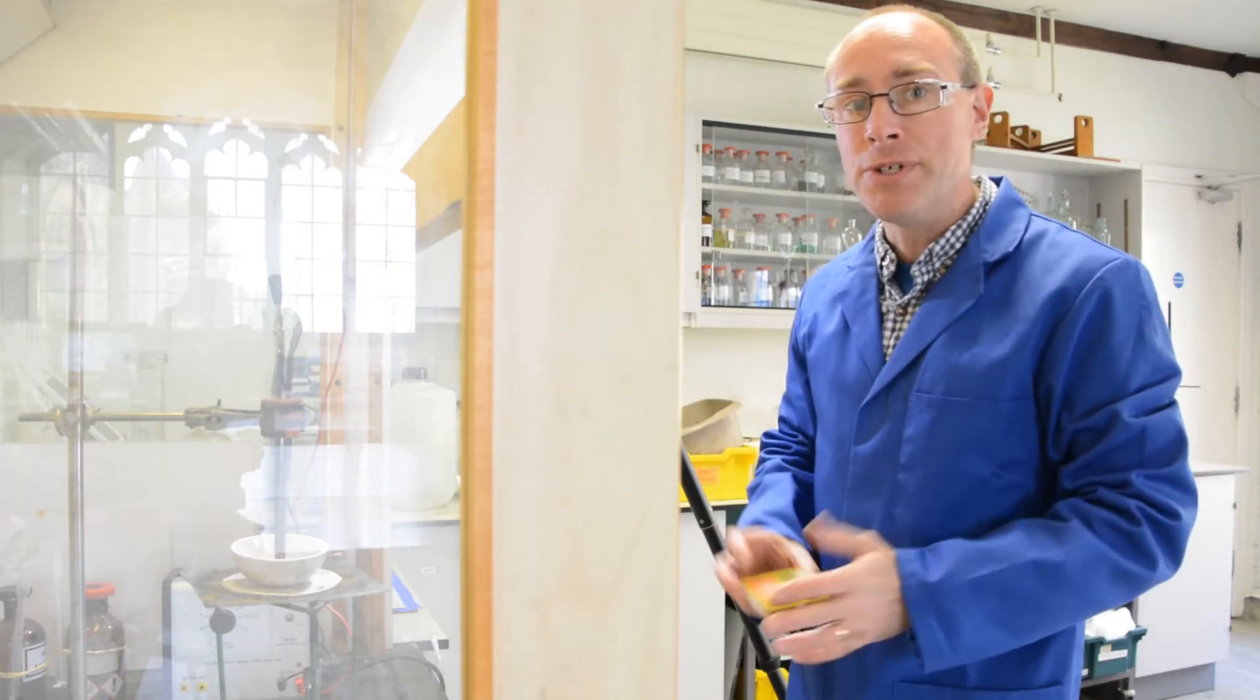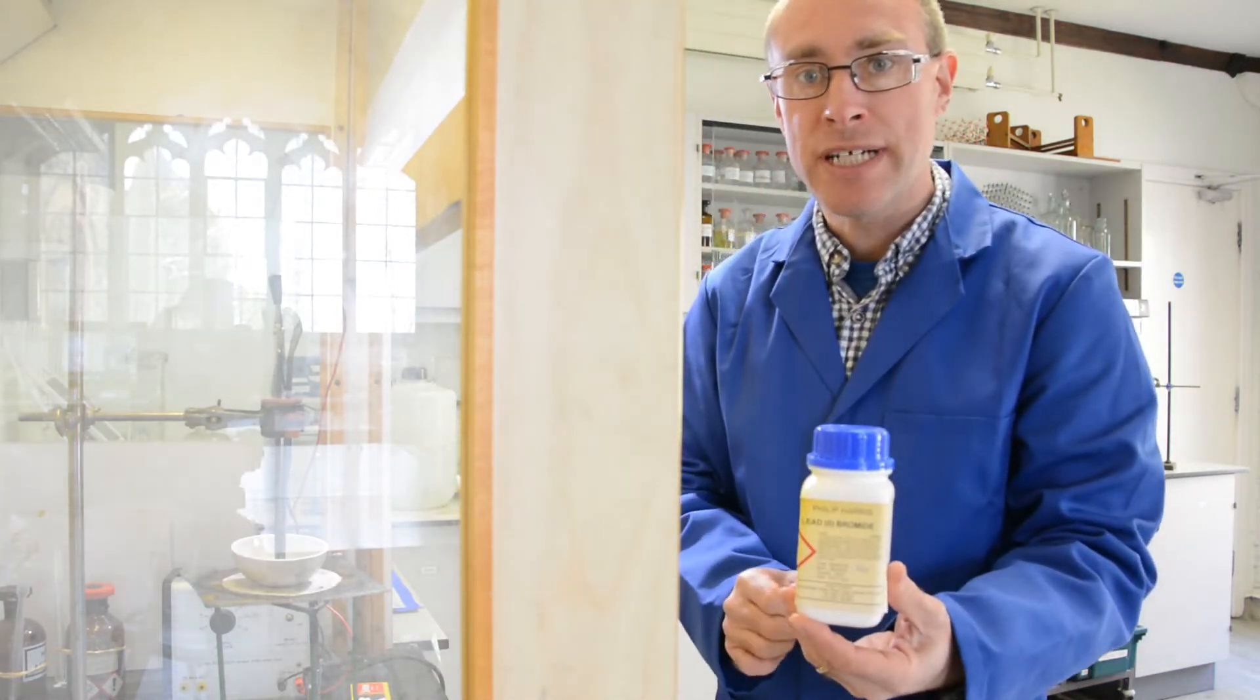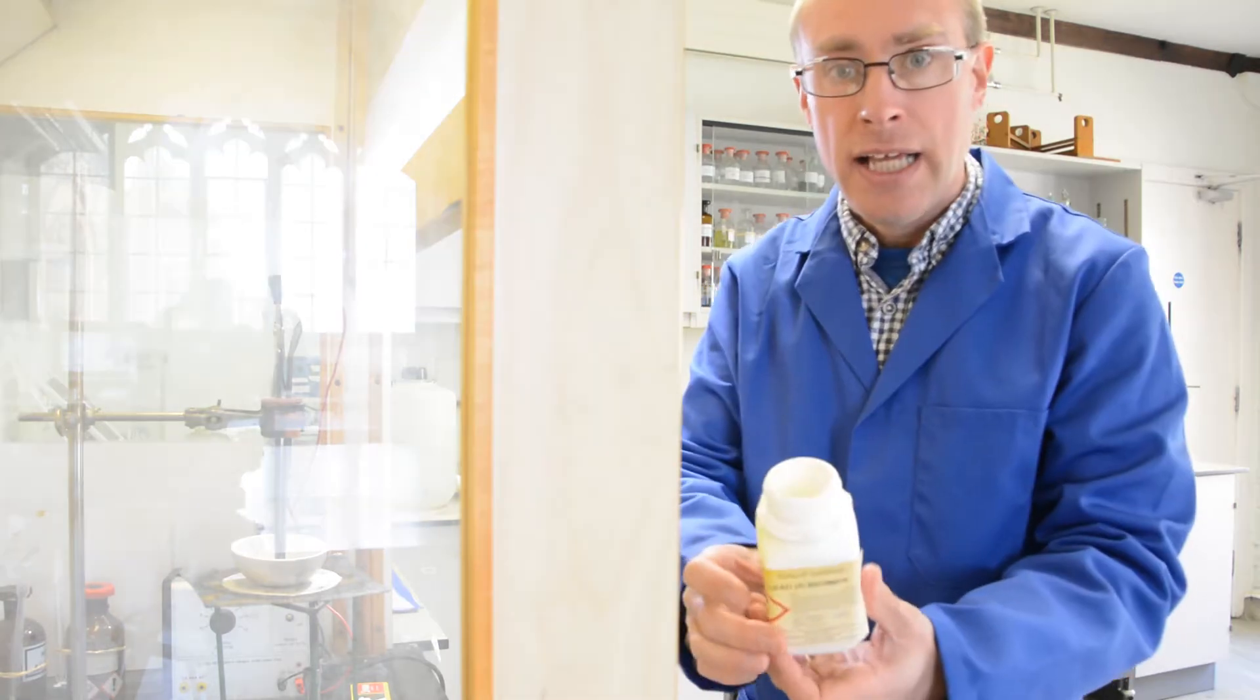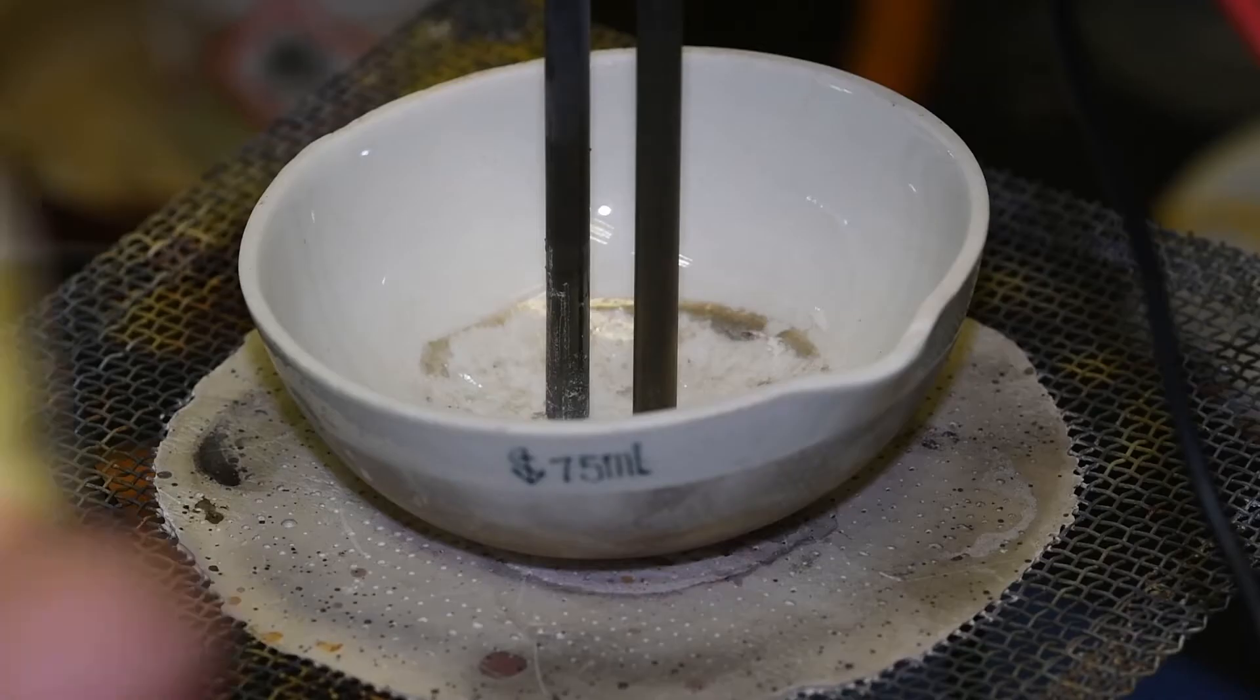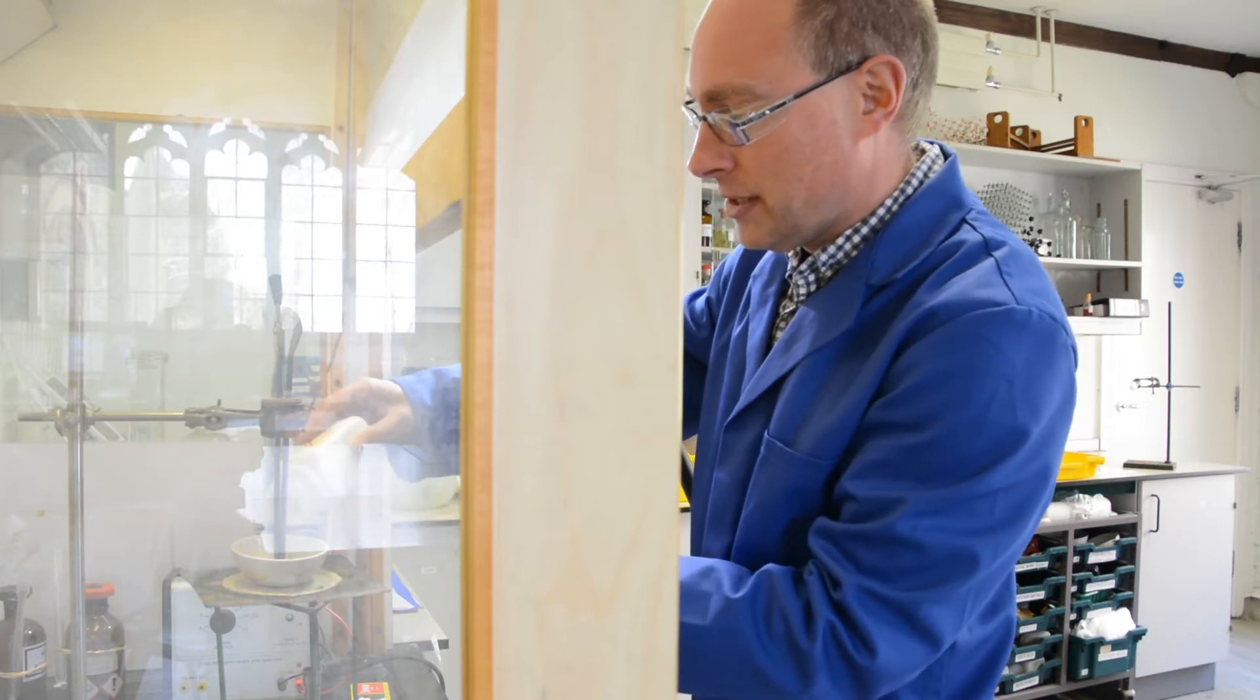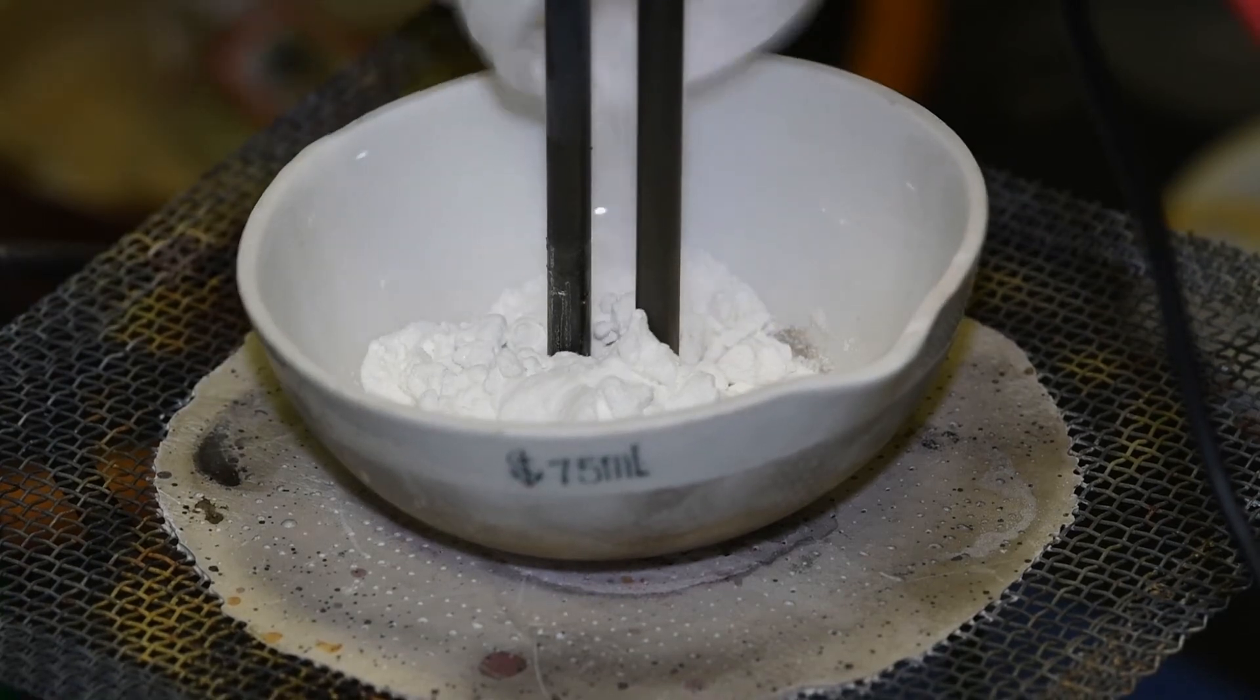In this video I'm going to show you the electrolysis of lead bromide. I've got some lead bromide here, it's an ionic compound and it's a white powder. First of all I'm just going to pour some into this crucible, just completely surround the electrodes in there.